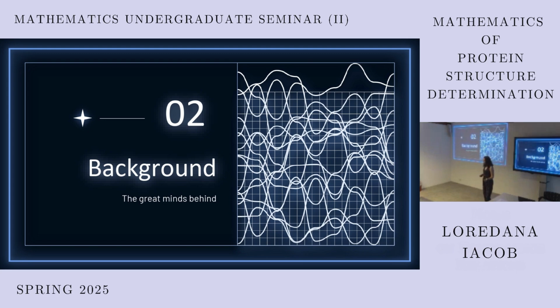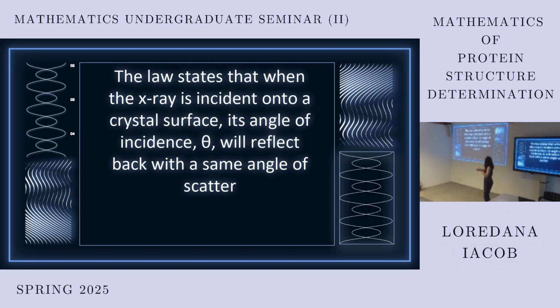But when the protein goes into a crystal, he said that when the incident ray is reflected on the surface of a crystal, like you have seen in the image with the protein crystal, the proteins are in parallel planes, and each plane can reflect the X-ray.